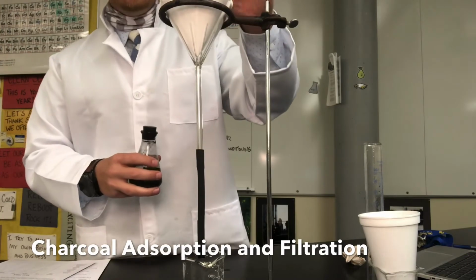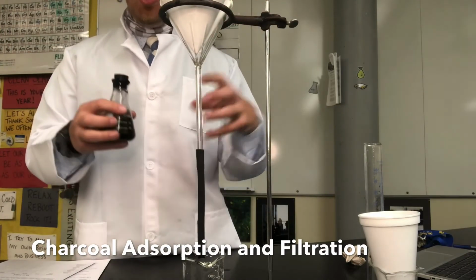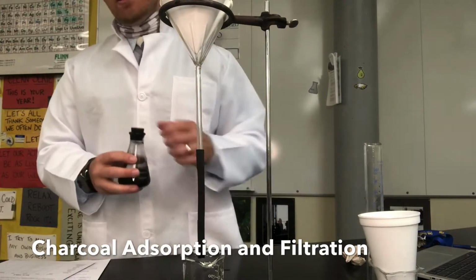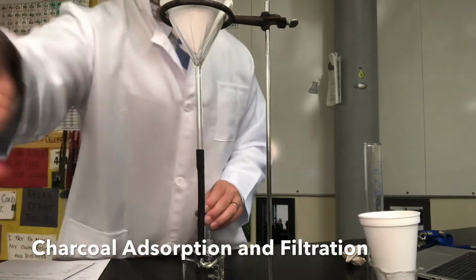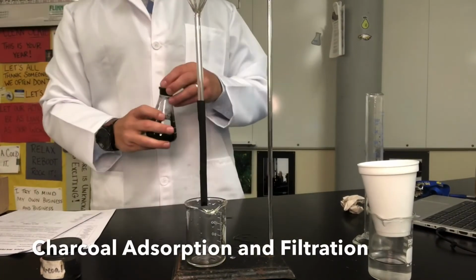Now if I pour it carefully, the filter paper should hold behind all of the charcoal and all of the impurities that stuck to the charcoal, and nice, clean, clear water should come out. I guess we'll see though. Let's go ahead and check. So I'm gonna actually angle down the camera, and we'll see if the water that comes out is clear.